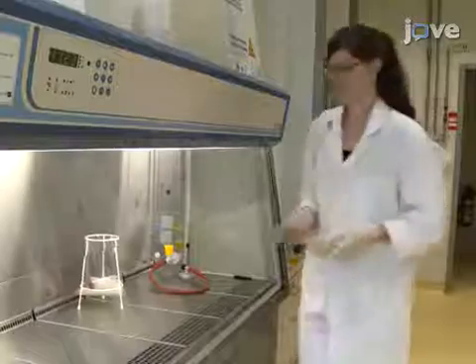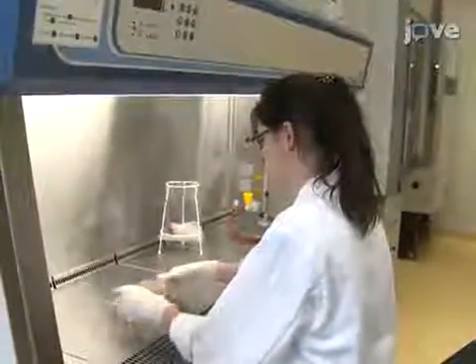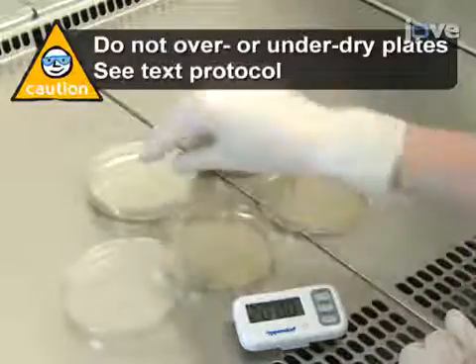To begin, place the LB agar swarming and sliding plates in a laminar flow hood and remove the lids. Allow the plates to dry for 20 minutes. The humidity of the plates in these experiments is critical. While excess moisture allows bacteria to swim, prolonged drying prevents swarming and sliding. Similarly, colony biofilm structure depends on the dryness of the medium.